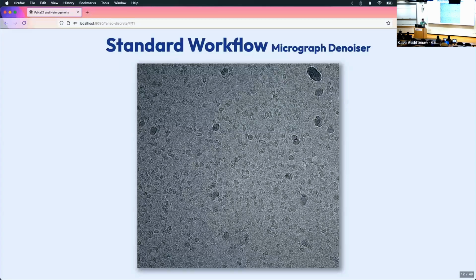Okay, so here is a representative micrograph from this data set. I would say this is actually a really nice micrograph. Here we can see this looks like a micelle side view. And then if you look, there are some little triangle-y shaped things that are the top view, right? This is a homotrimer, so it makes these little triangles.